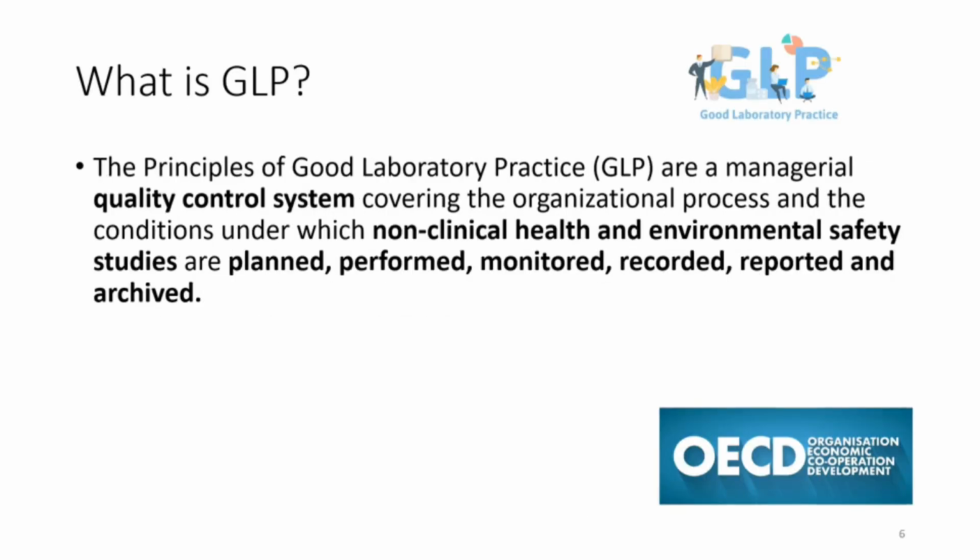The original principles of GLP were developed by the FDA following the investigation in the 1970s. So GLP has actually been around for quite a few decades. Today, most of the laboratories follow the GLP principles by the OECD, the Organisation for Economic Co-operation and Development.